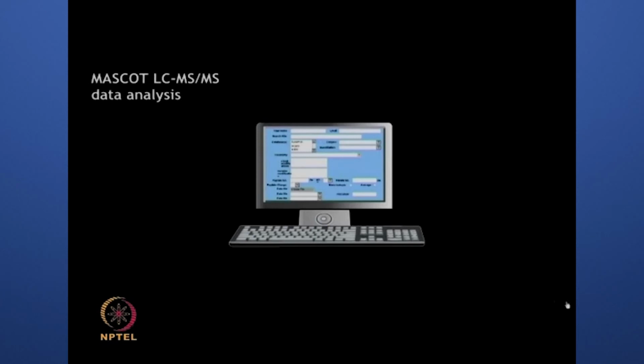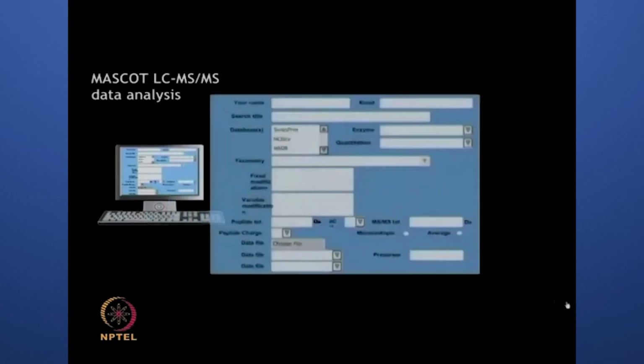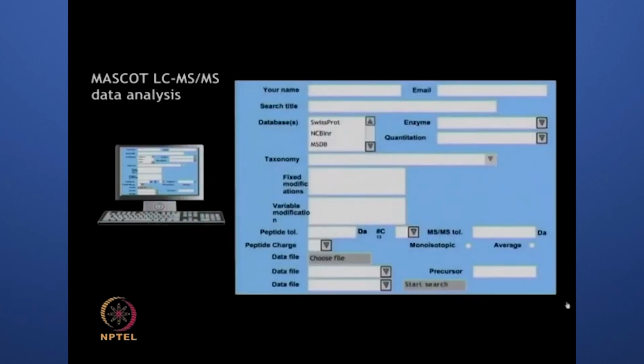The data obtained from tandem mass spectrometry following a SILAC experiment can be analyzed by means of Mascot search engines.